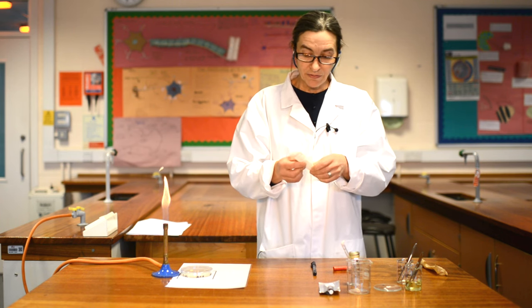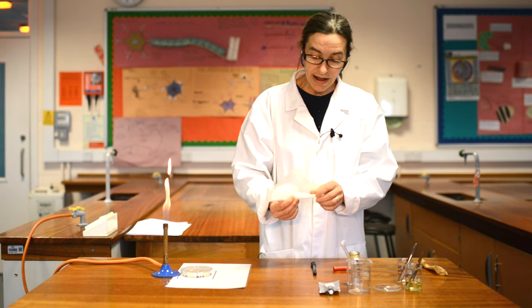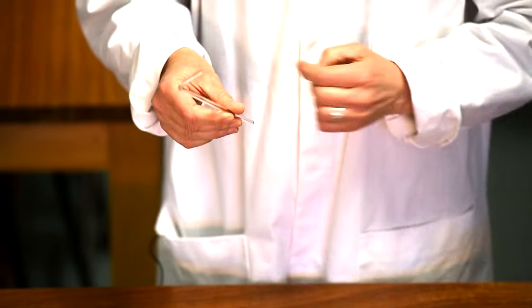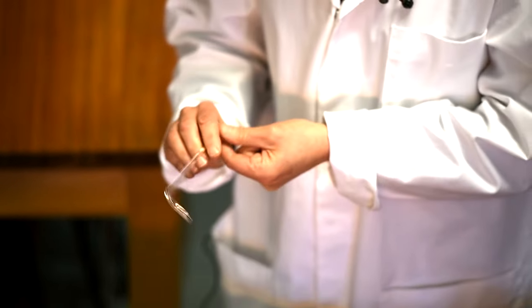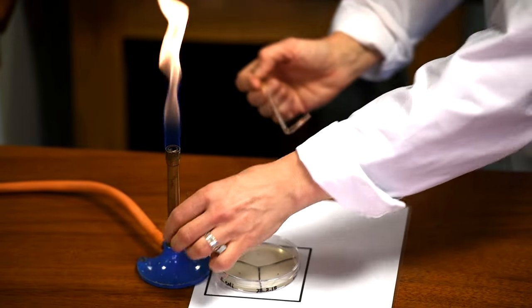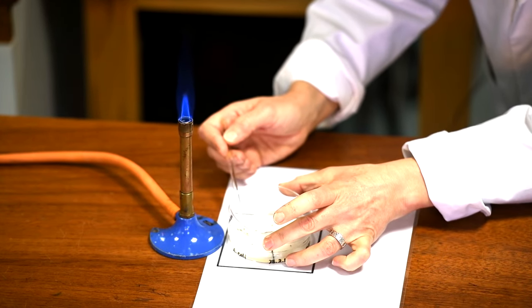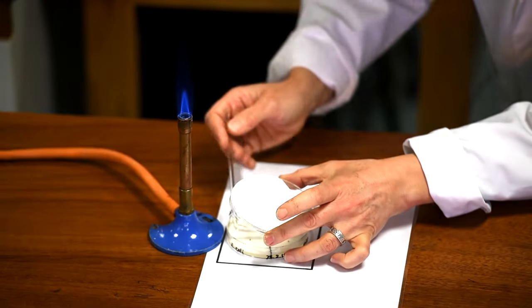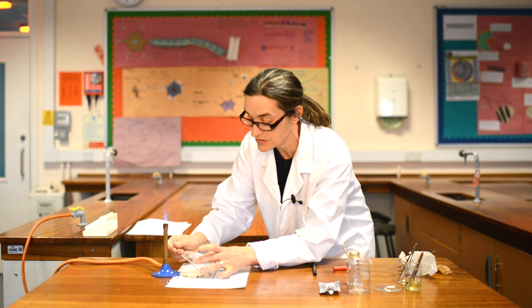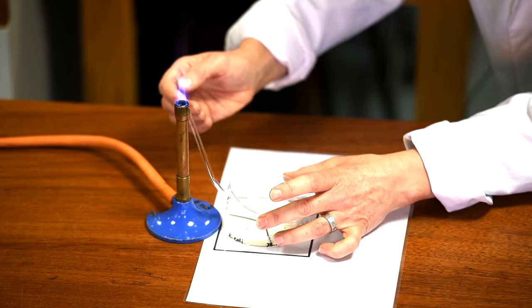Your lab technicians will have wrapped a glass spreader in greaseproof paper and it's been in the oven. So I'm only going to hold it on this end — that end is sterile, I don't want to go anywhere near the other end. I want to use this spreader to spread that liquid out over the entire agar plate. Blue flame, lid off pointing towards the flame, and with as little time open as possible, spread the bacteria over every single part of the plate. There we are, and close.